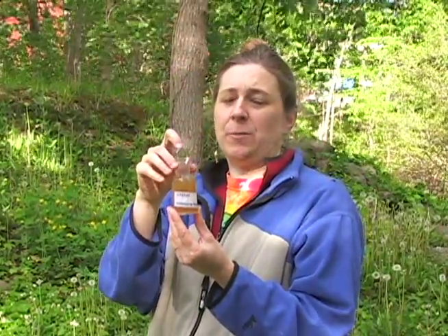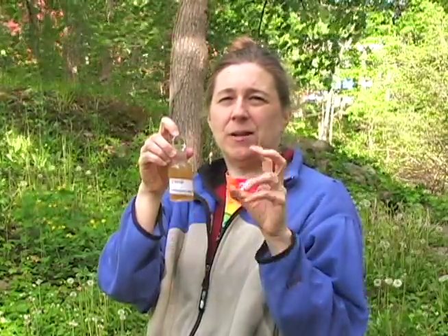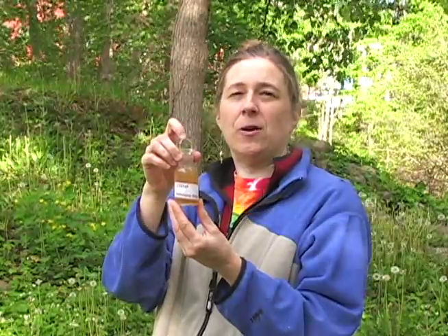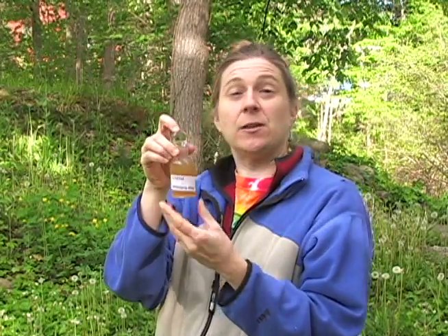After you add the reagents, the bottle contents get really cloudy and flocculent. There's a bunch of stuff floating around. It has to sit and settle out for a few minutes before you can add the third reagent. So, into the cooler.